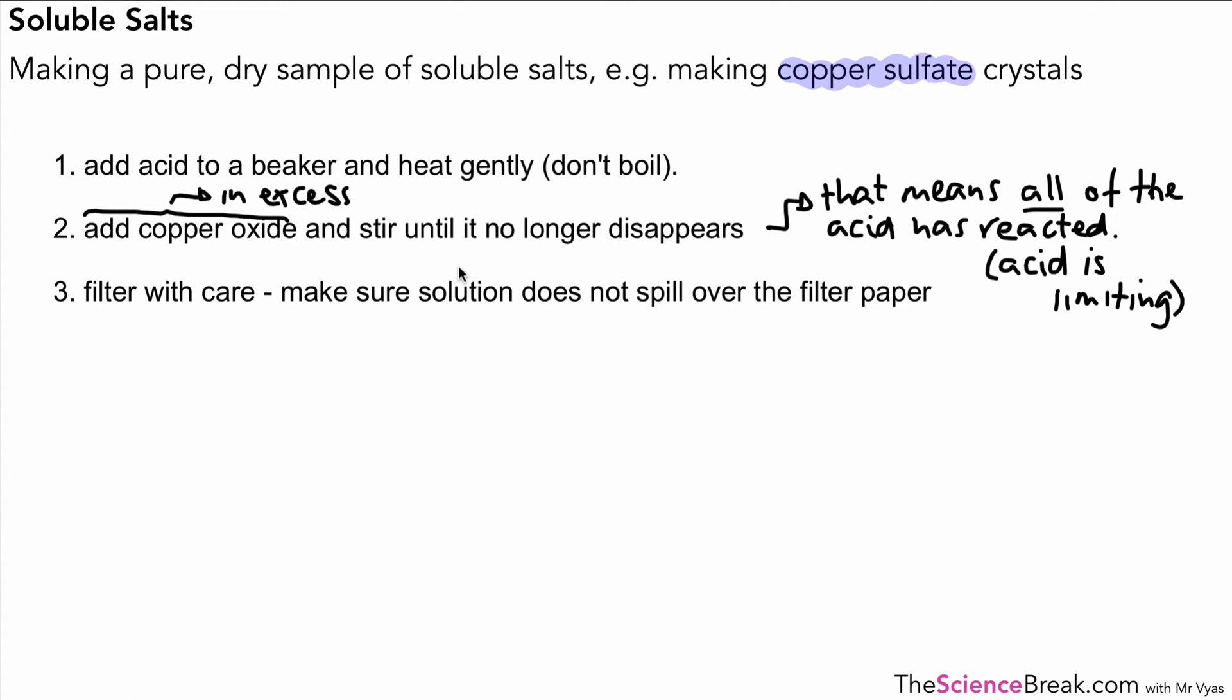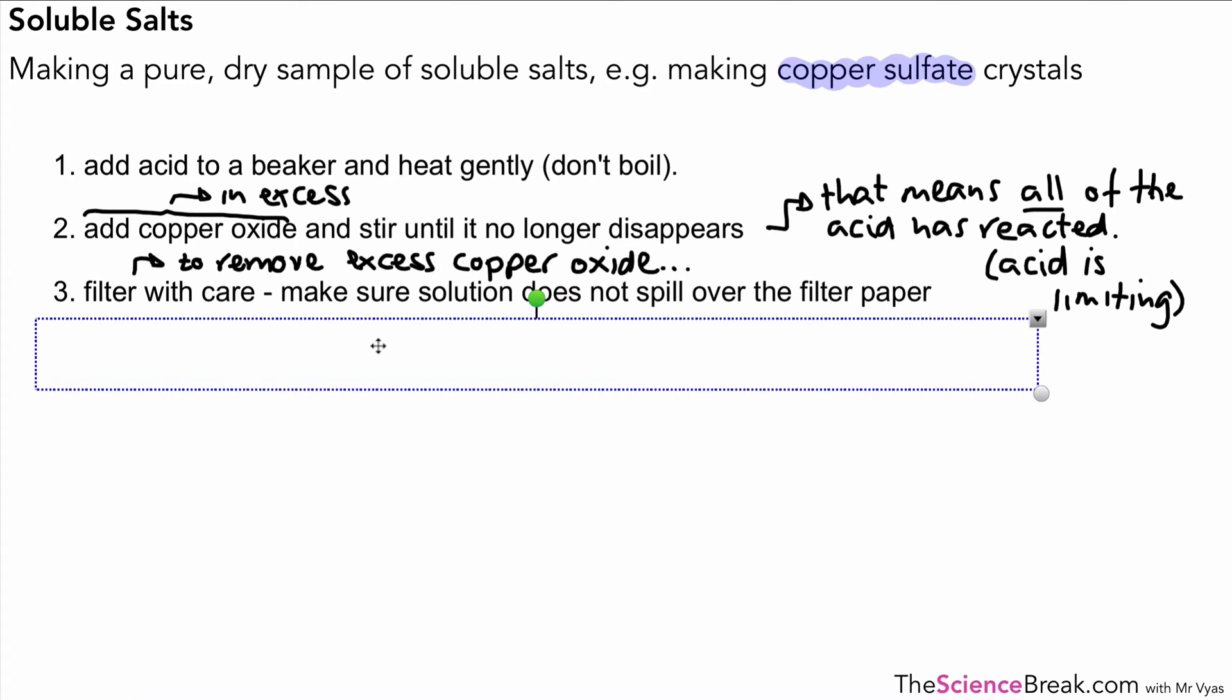Next step is to filter with care. We make sure the solution doesn't spill over the filter paper when we filter. The reason why we filter is to remove any excess or any unreacted copper oxide. That would interfere with the making of the crystals if we left it in there.